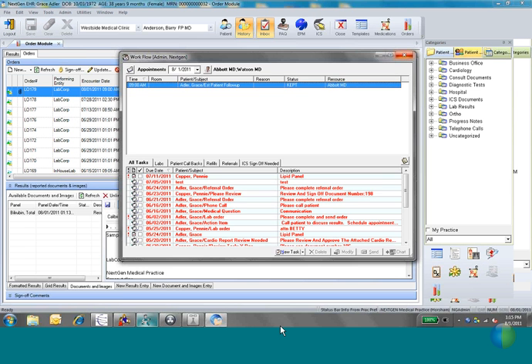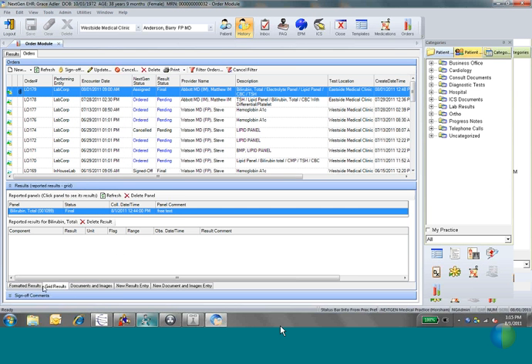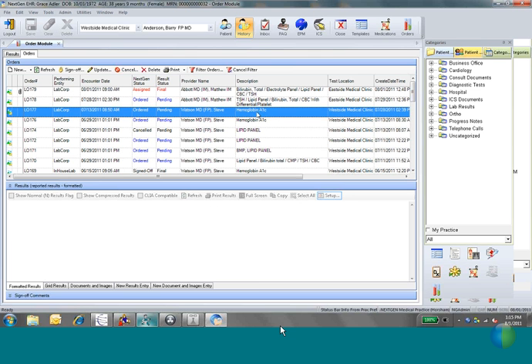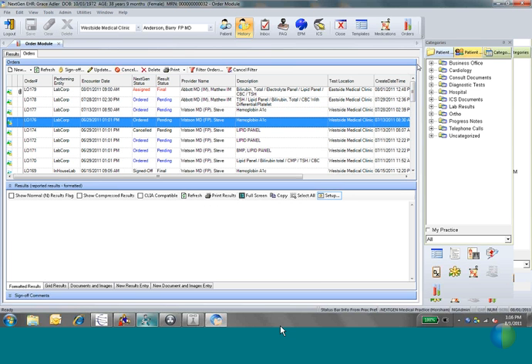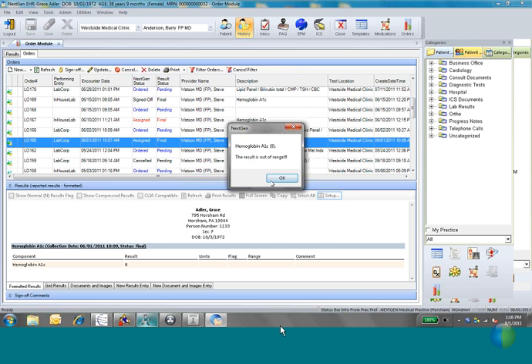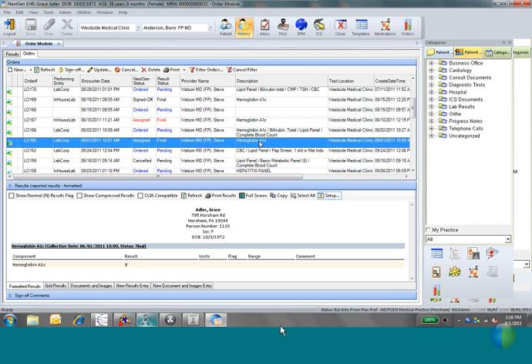So let me go ahead and go to my formatted results for this. Yeah, they are per user. Oh no, those don't have results. Let me see down here. Okay, yeah, they're per... Oh, never mind, I'm crazy. They're actually for everybody, for you to be able to do that. So they're not per provider.